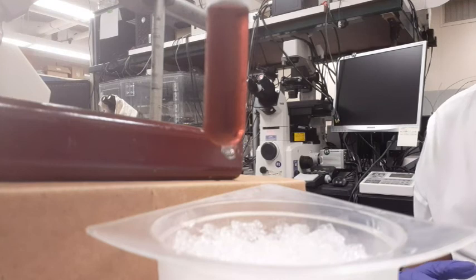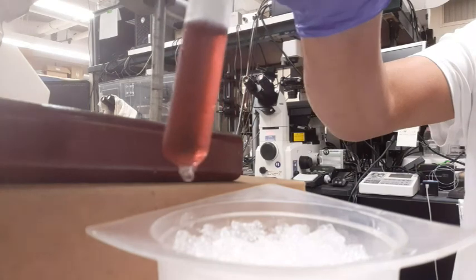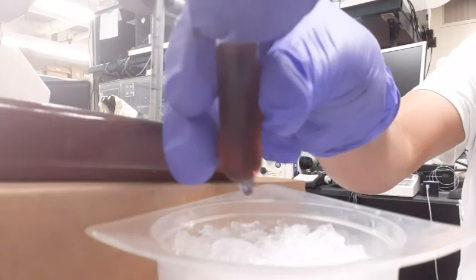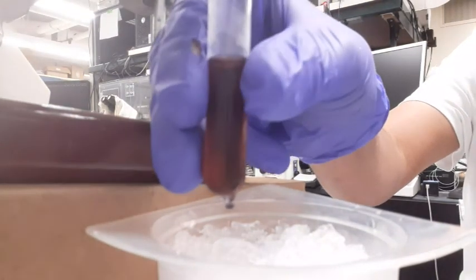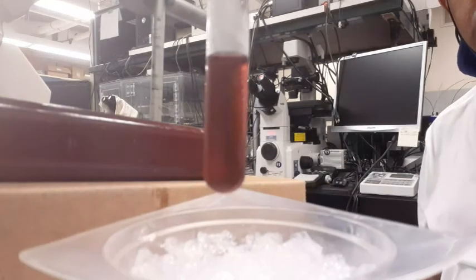This is the demonstration of Le Chatelier's Principle. You can see that the blue color has disappeared and the pink color has emerged.